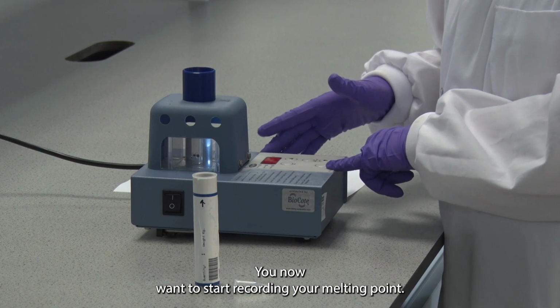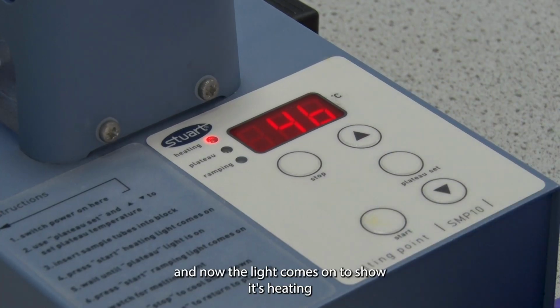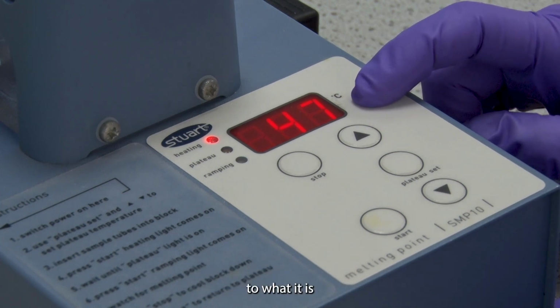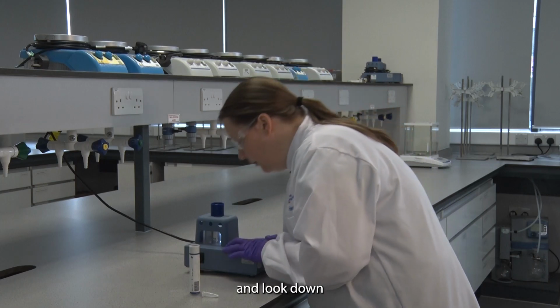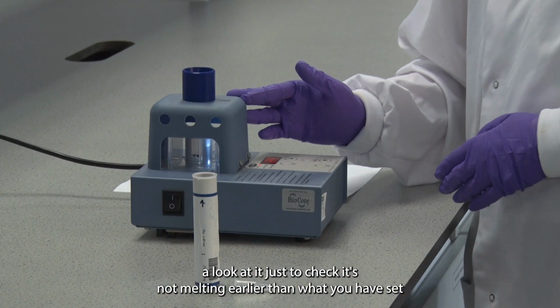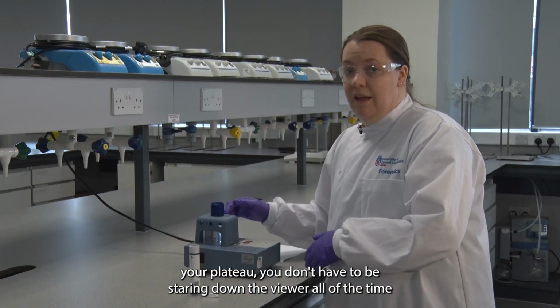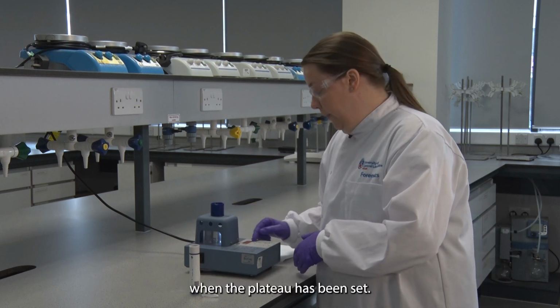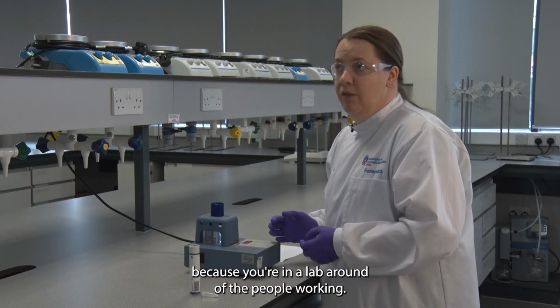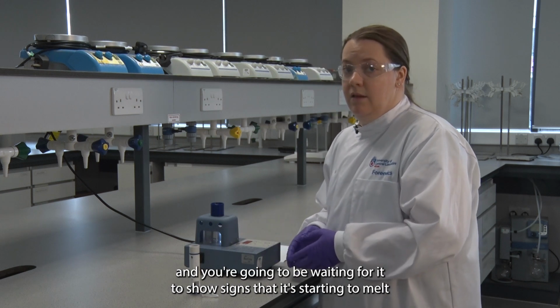You now want to start recording your melting point, so you just press start. And now the light comes on to show it's heating, and the dial will gradually increase to what it is. And look down and keep having a look at it just to check it's not melting earlier than what you have set your plateau. You don't have to be staring down the viewer all of the time when the plateau is being set. While you're doing this, I would keep your safety glasses on because you're in a lab around other people working, and you're going to be waiting for it to show signs that it's starting to melt.